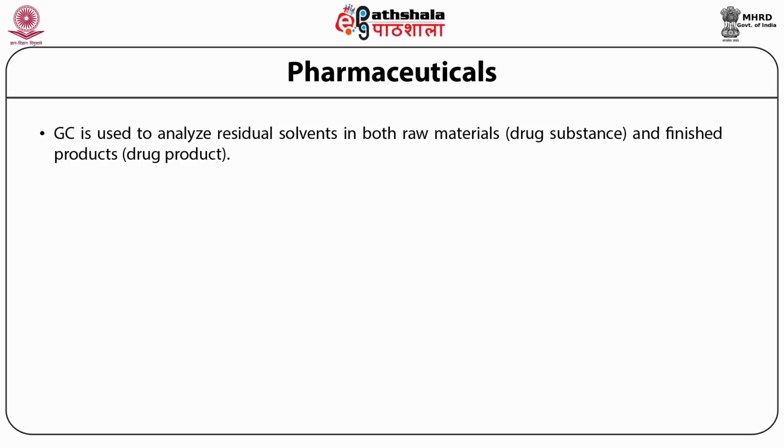Knowing the amount of each compound in a given sample gives a huge advantage in studying the effects of the drug on human health. In fact, pharmaceutical analysis generally involves two steps: separation of the compound of interest and quantitation of the compounds. The better the separation, the easier is the quantitation.